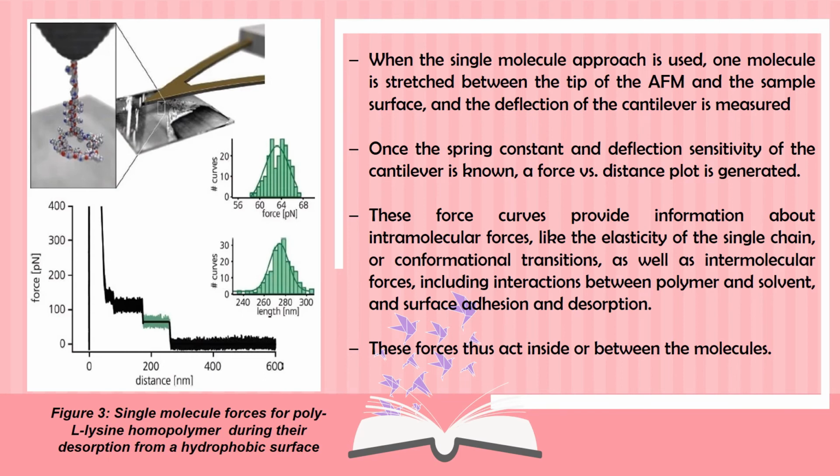One case of force spectroscopy measurement is shown in Figure 3, using poly-L-lysine molecules during their desorption from a hydrophobic surface. The other method uses measurements of the deflection produced in the cantilever as the AFM tip indents the sample.